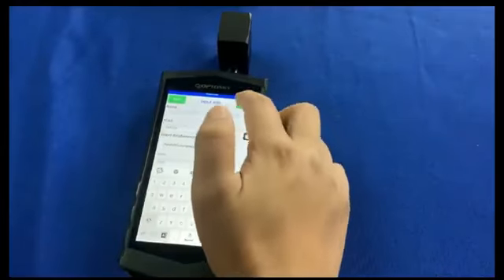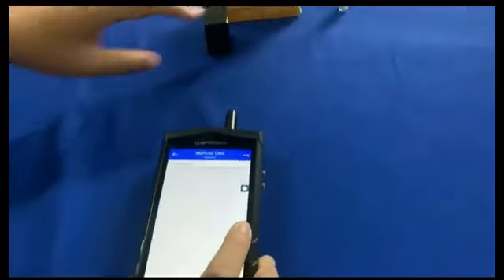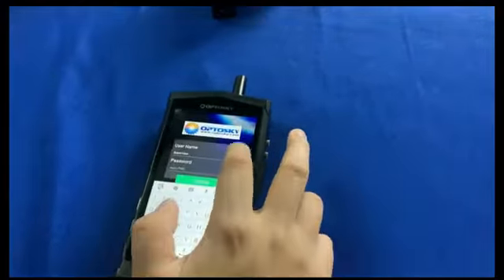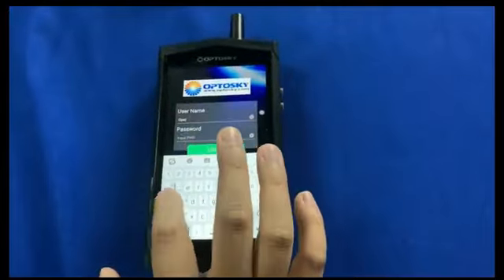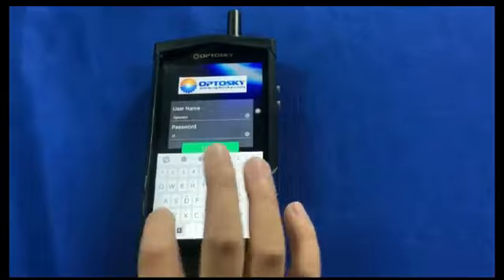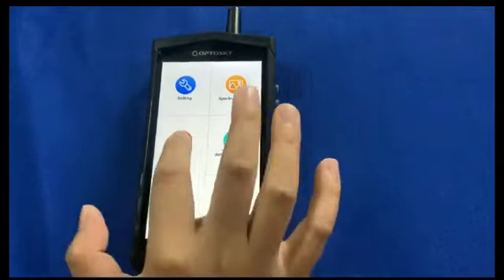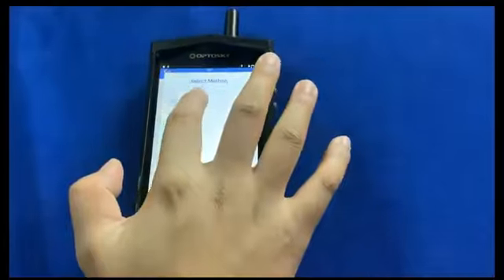We execute ID, such as when needing to use paracetamol, and such as we perform 2 samples. For the batch number, you can just scan the barcode. And then you can perform the identification.